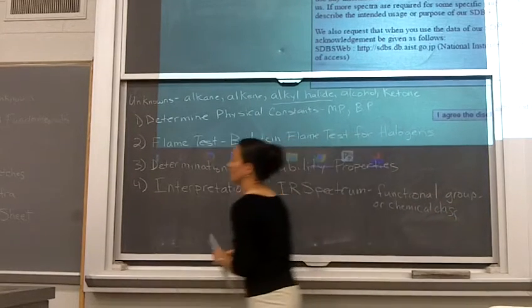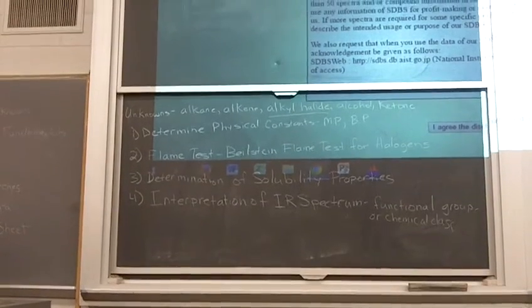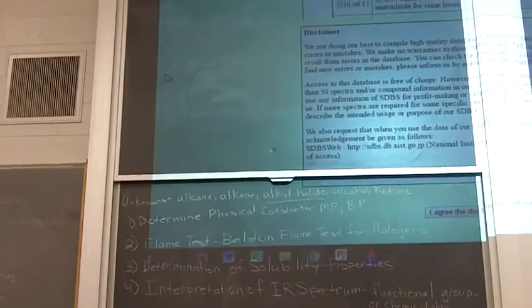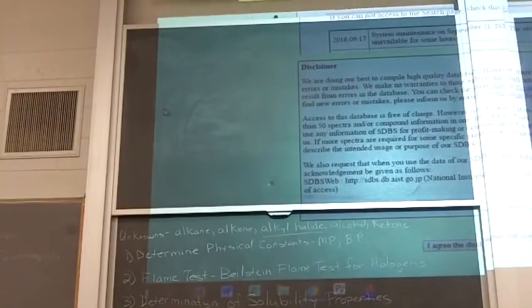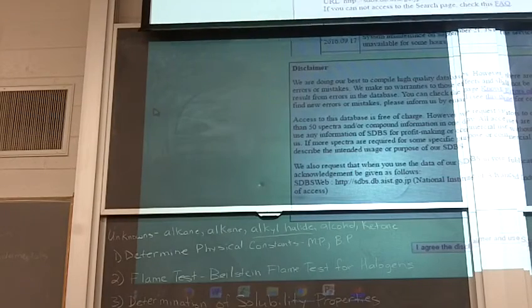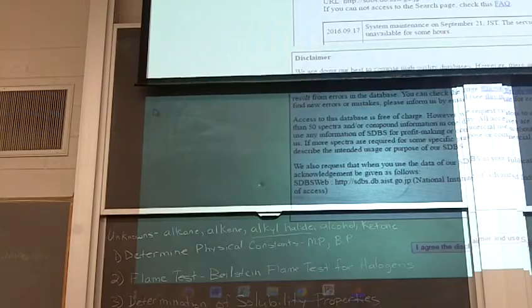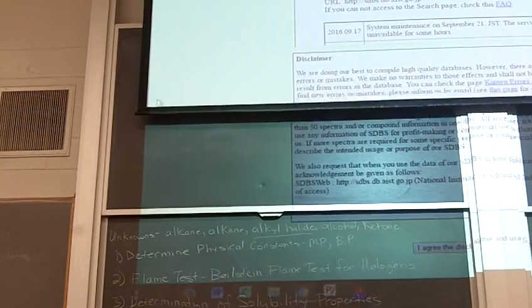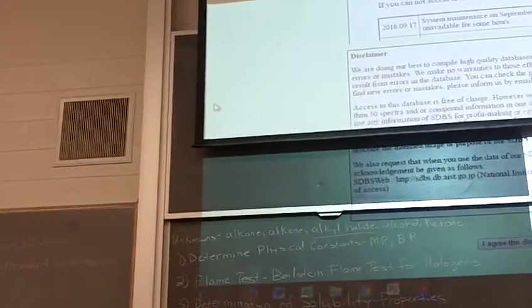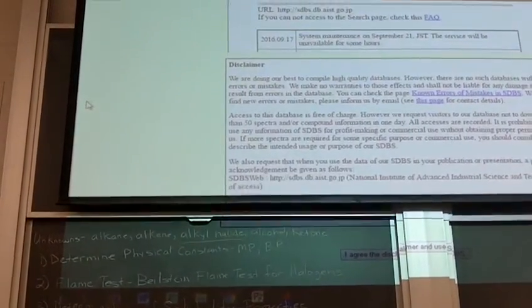Once you have collected your IR spectrum, you're also going to compare your IR spectrum to a literature IR spectrum, okay?